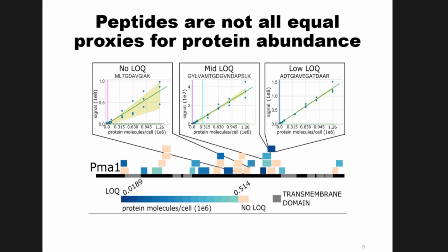Oh, one more, sorry. Let's assume I have these 100 peptides. I don't know the exact quantities. I don't have the money for it, but I have them all crude. If I want to do relative quantification across several samples and I just want to know what kind of intensity is reliable and what isn't, I don't need to know, right?